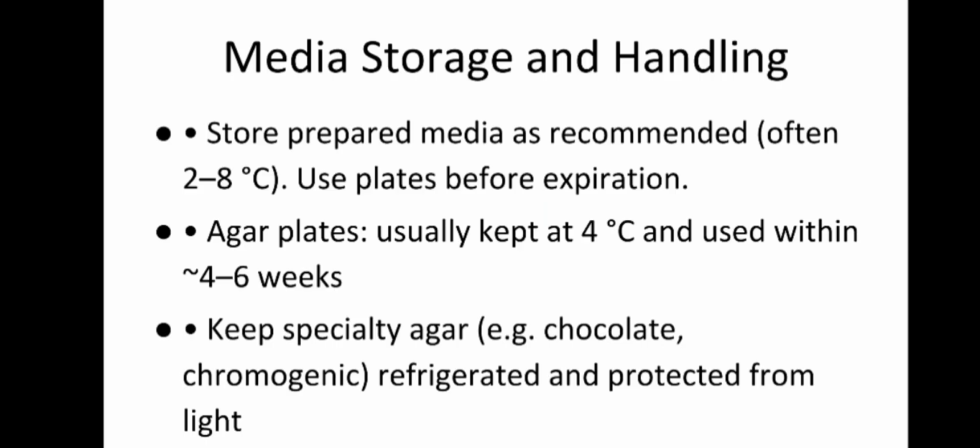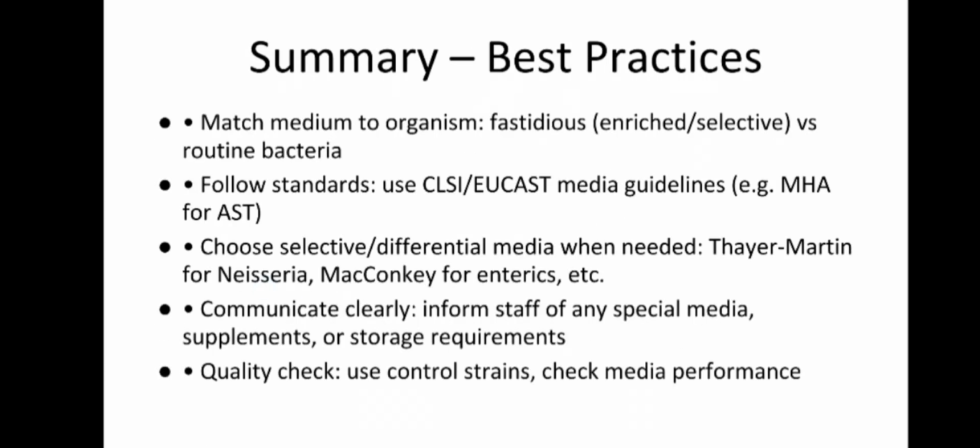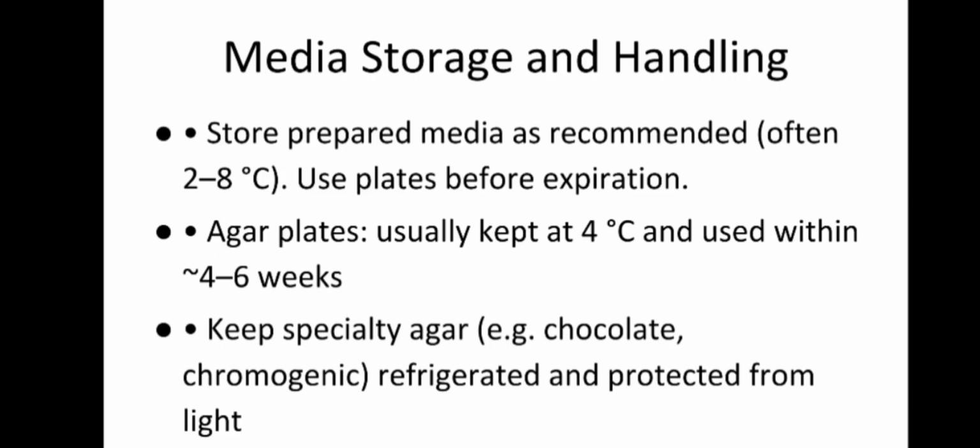So when ordering new media, check if it needs refrigeration or light protection, and always inform lab managers and students to avoid unnecessary hassle and contamination. Agar plates are usually kept at 4 degrees, and they are never frozen. So we never keep them below 4 degrees Celsius or 2 degrees Celsius. We never freeze them basically.